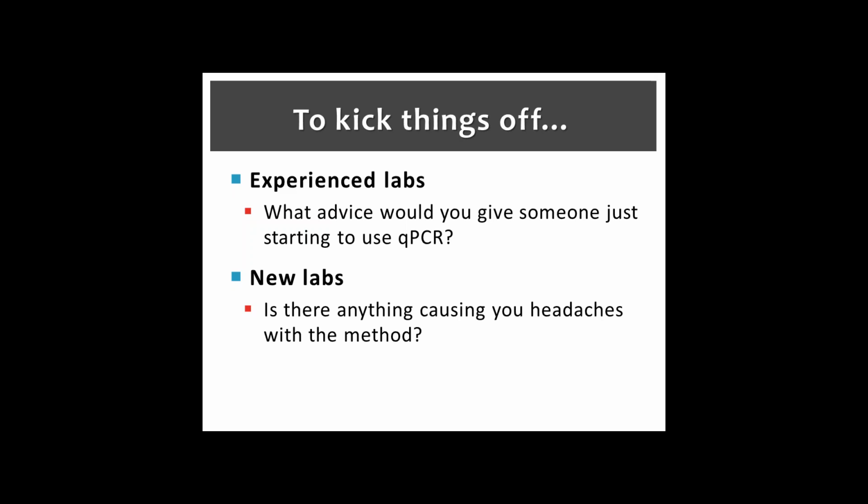Okay. For those of you who couldn't hear, they're talking about, this is a new to qPCR table, and so they're just starting out. So again, can we have a show of hands of the people who are just starting out? Right, great. One of the topics of conversation that came up is going out and collecting samples even right now, just to be able to work with the equipment and learn the method. Filter and freeze, yes, filter and freeze, and then move on.